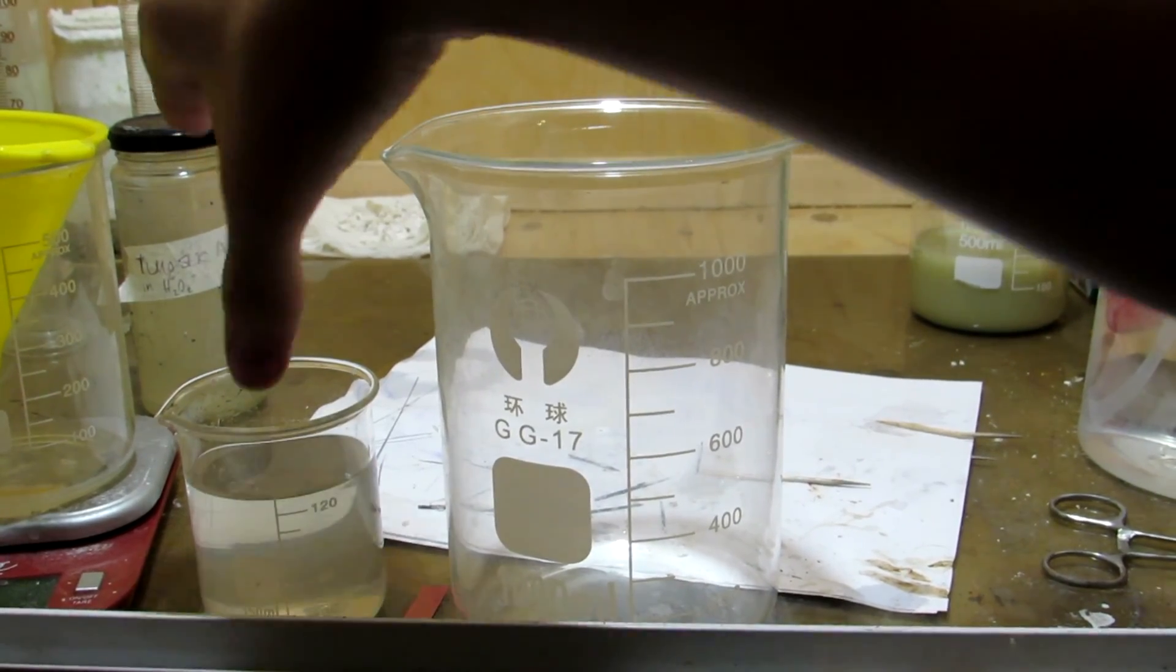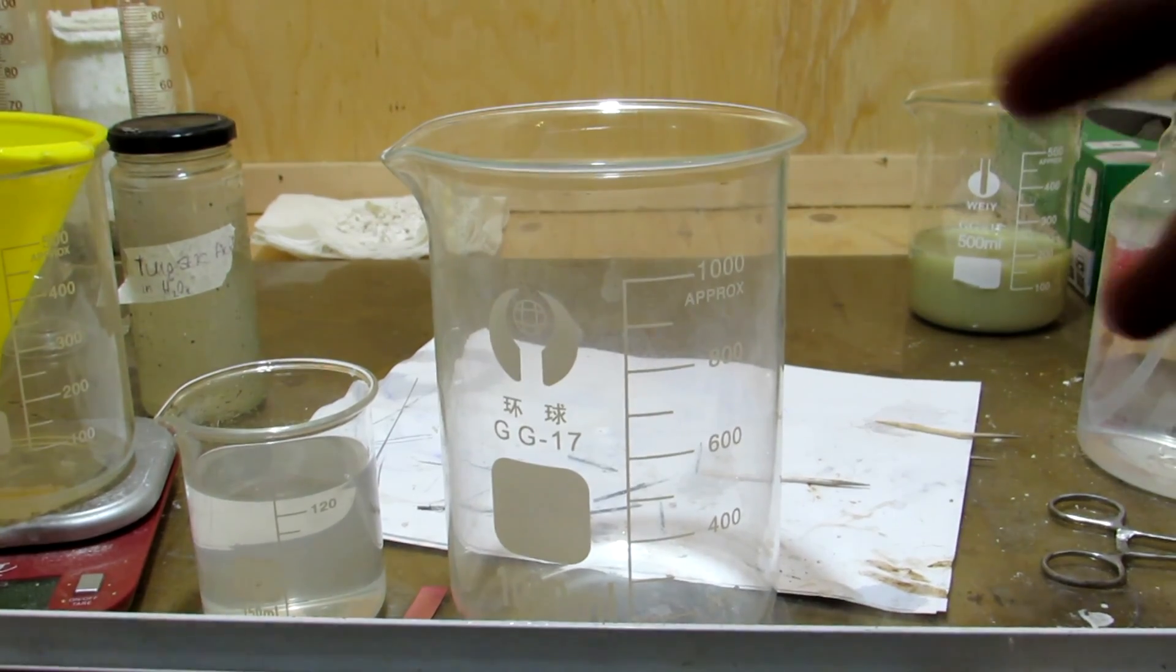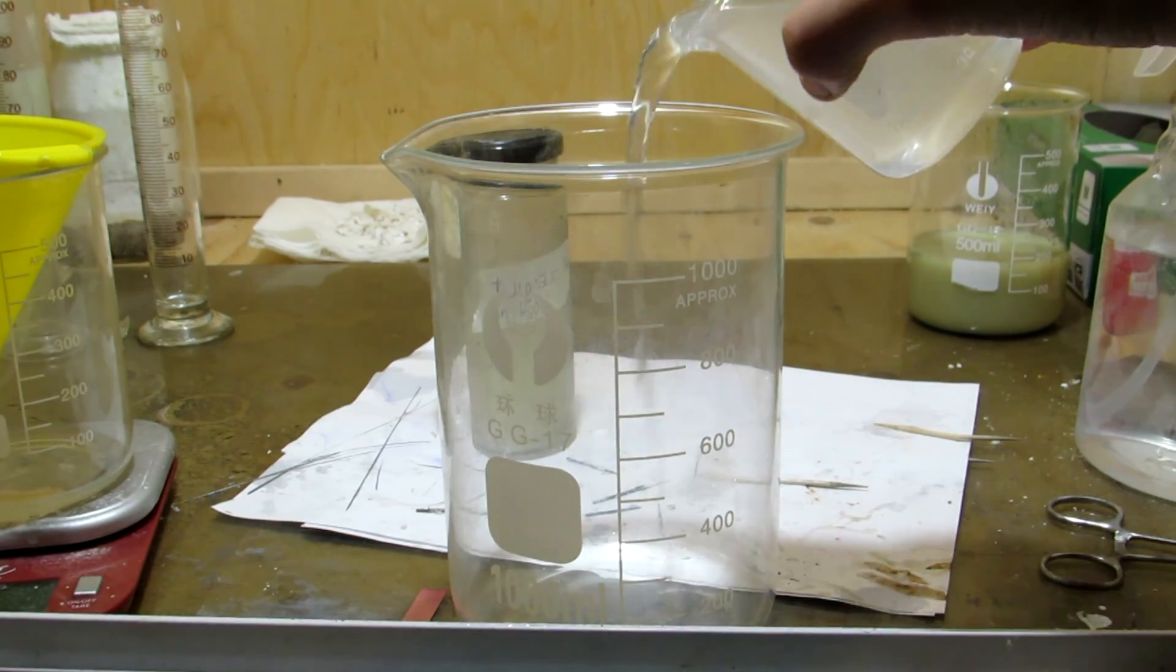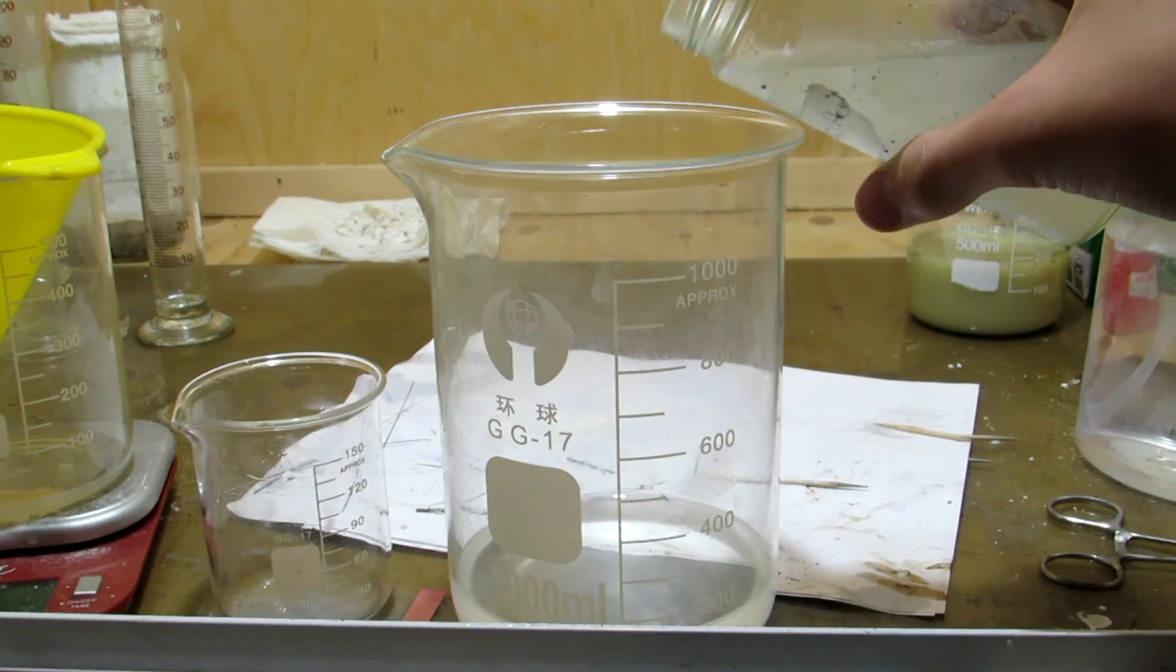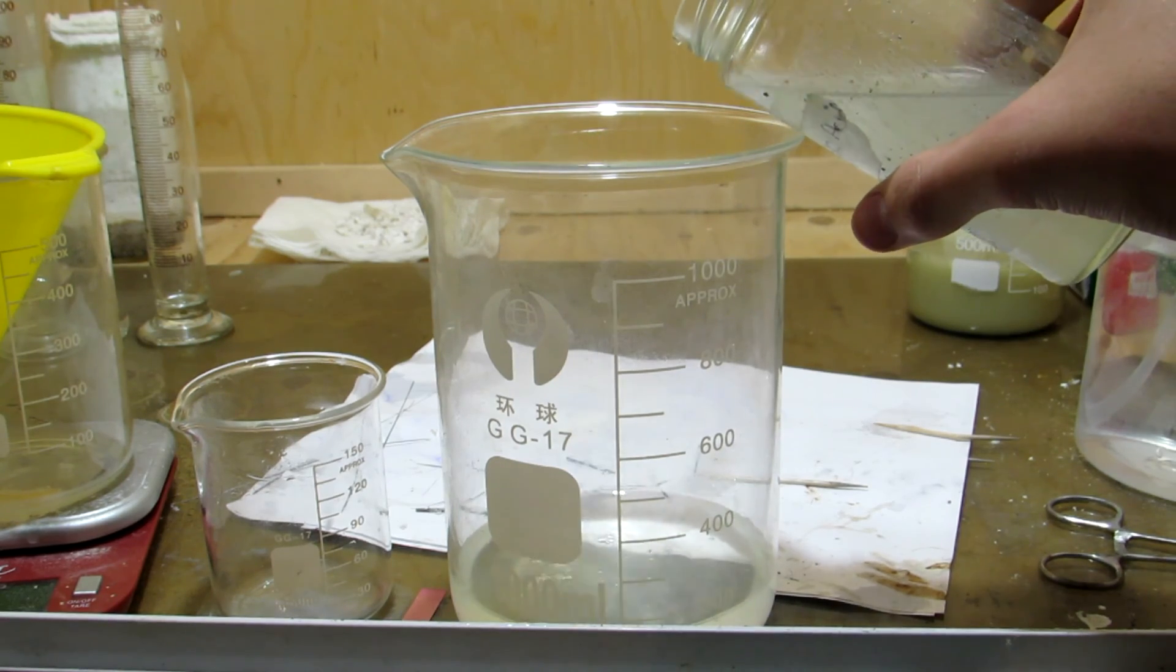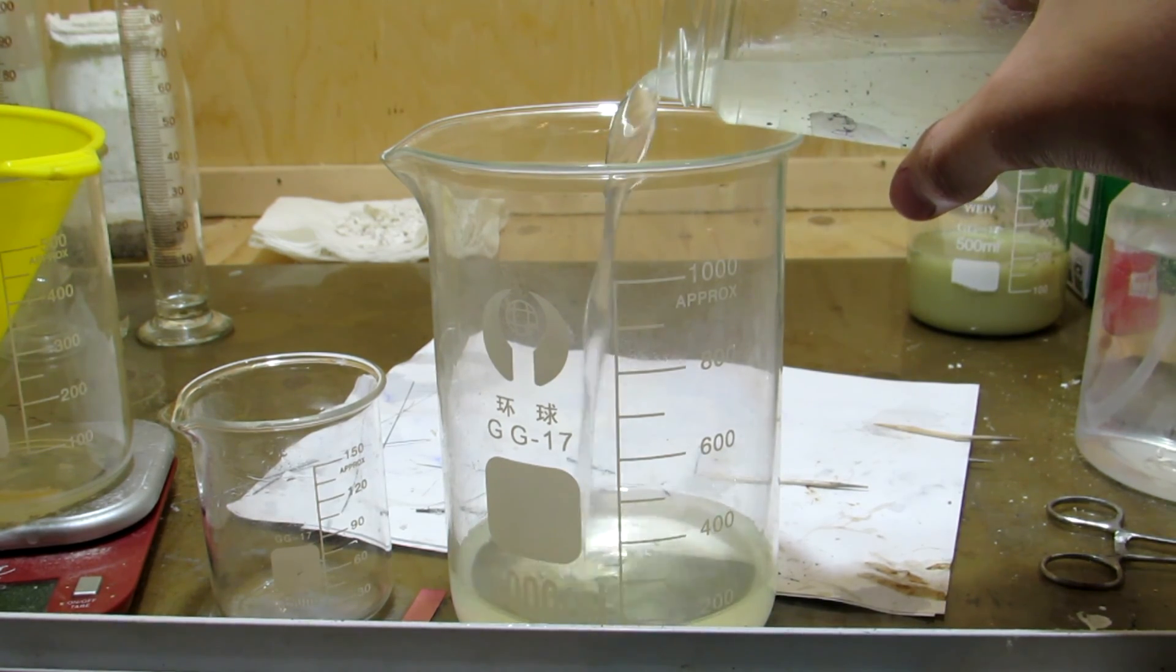While that is dissolving, we can convert the sodium tungstate and tungstic acid to tungsten trioxide. First, the tungstic acid solution is added to the sodium tungstate, and excess sodium hydroxide will react to form more sodium tungstate.